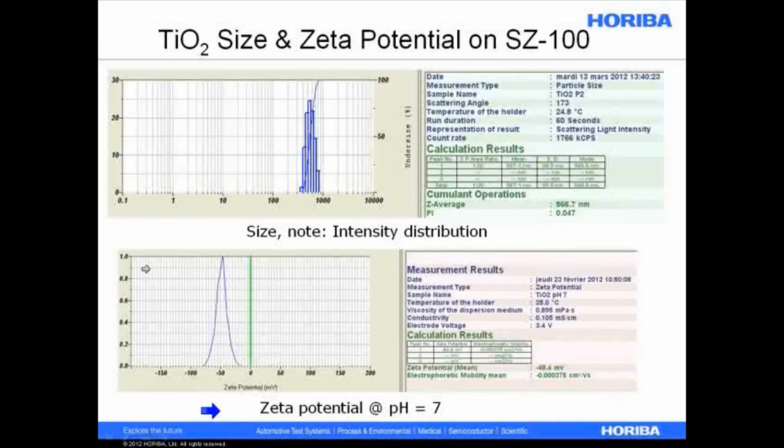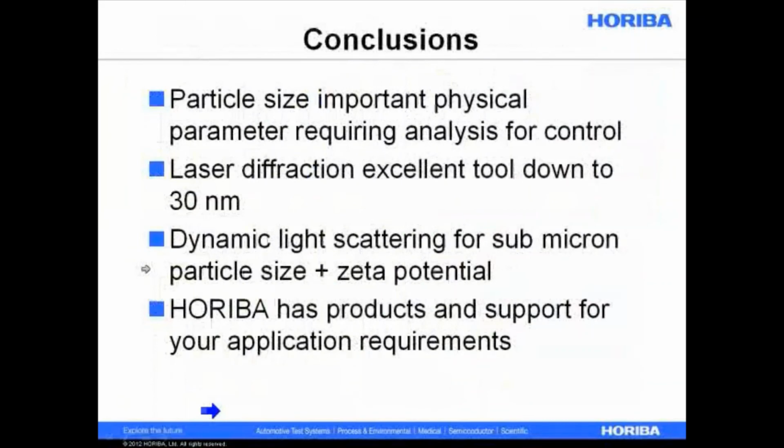So far you've just heard kind of easy measurements. In general, the data we generated here weren't all that hard to generate. Particle size is critical for this realm of pigments. I should be careful. When you do the method development of pigments, the choice of refractive index is very important. The concentration is important. The dispersion is important. So I shouldn't say they're the easiest samples out there.